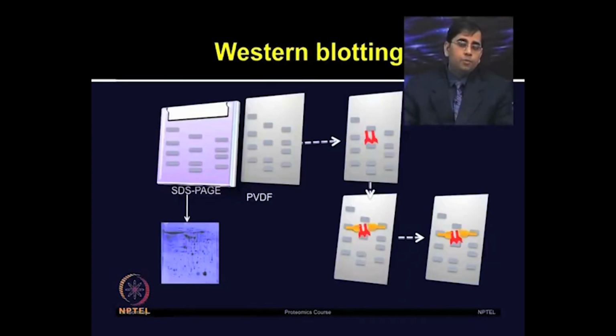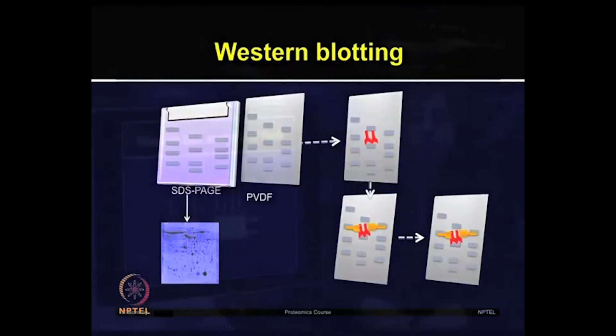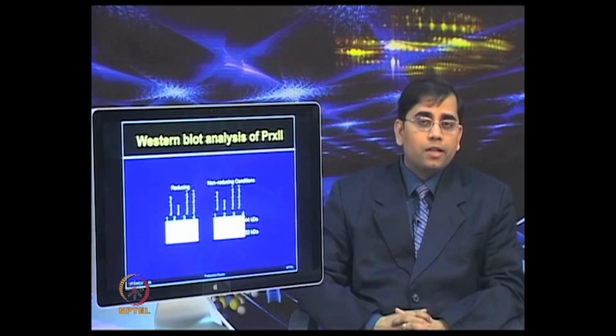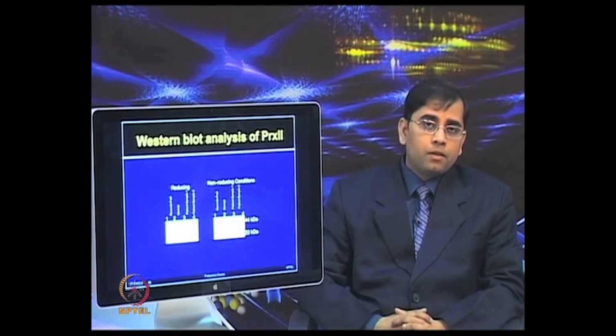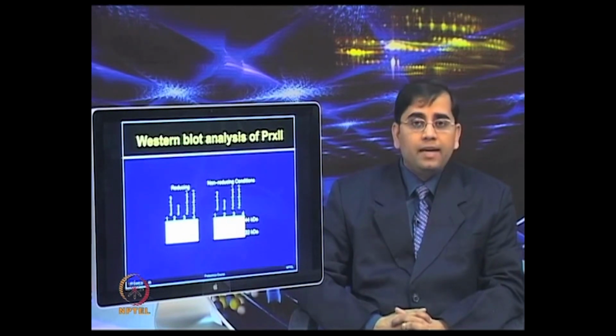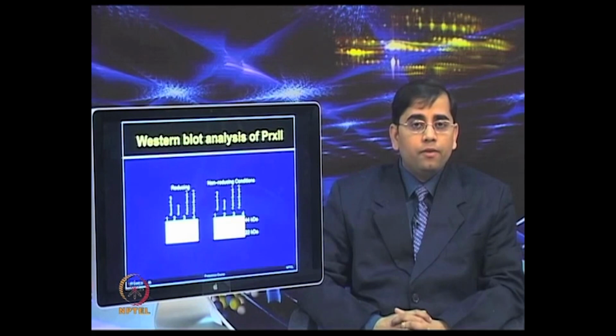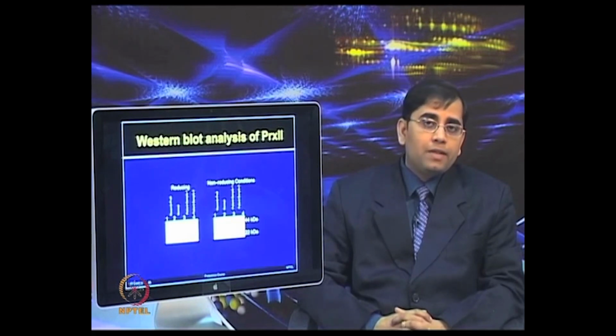After the identity of these proteins was established, Western blot analysis was used to validate a few targets. Among the identified proteins, the authors found that peroxiredoxin 2 was very interesting. They observed that an intracellular protein, PRX2, was exclusively found in the plasma of SARS patients, but was absent in the healthy individuals.